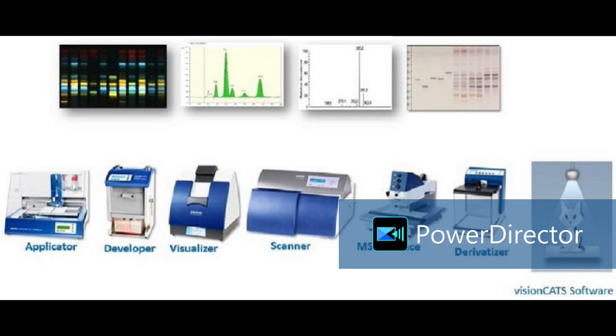But right now that is not there. Its main detector is called the visualizer. Miniaturization is also something to think about for R&D. Yes, not many labs have the luxury of that much space. Camag is working on this visualizer.